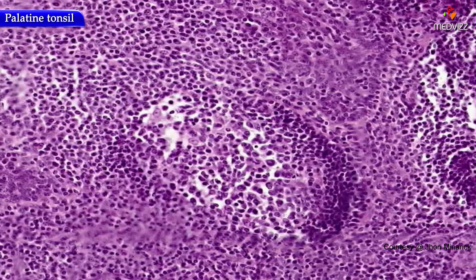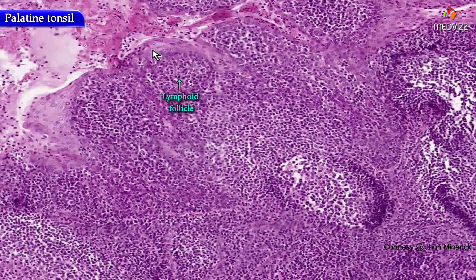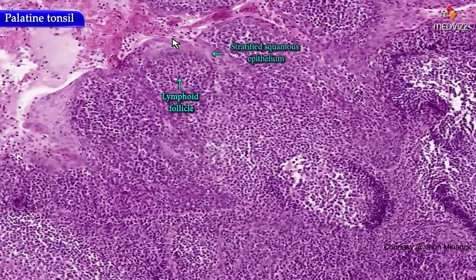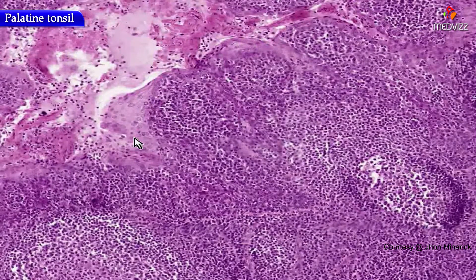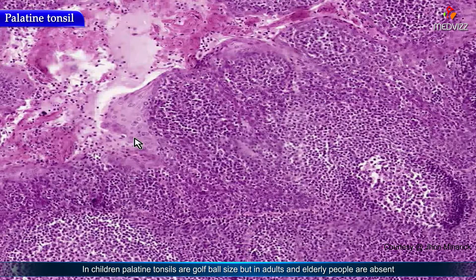Of the three types of tonsils, remember that the only one that has follicles intermingled with stratified squamous epithelial-lined clefts or crypts is the largest of all the tonsils — the palatine tonsils. In kids, palatine tonsils can be almost as big as golf balls. In adults and elderly people, they can be virtually absent because, like the thymus, lymphoid tissue involutes or atrophies with old age.